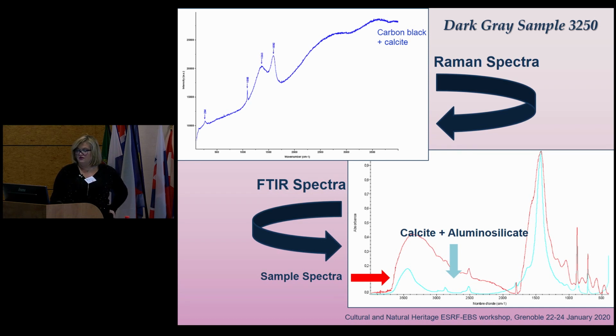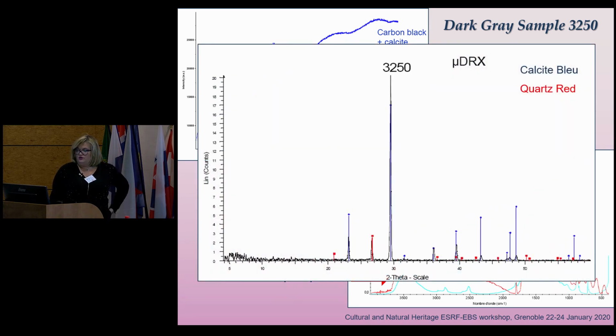We study the shoulders, and we assign each band to a ligand, in vibrational spectroscopy. Usually we also make the deconvolution of all the bands. We also do X-ray powder diffraction, but in this case the pattern was not so good, so we had to come to a high resolution beamline to have all the patterns with a good result.